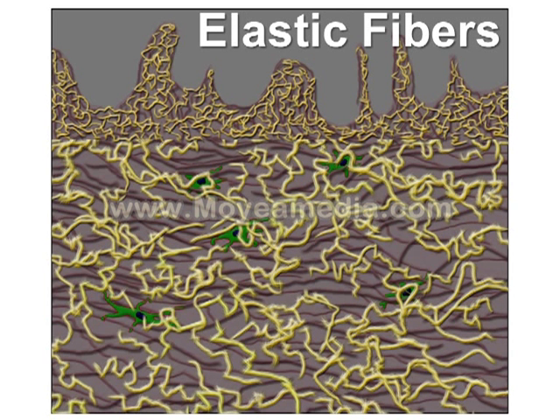Elastic fibers form a network that extend into the papillary dermis. Disruption in the elastic fibers would be typical of entities such as a scar and scarring alopecia. Elastic fibers are also displaced by melanoma, and that staining can be very helpful in distinguishing nevus from melanoma.